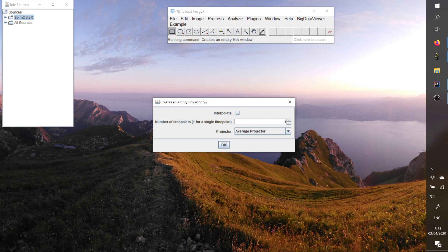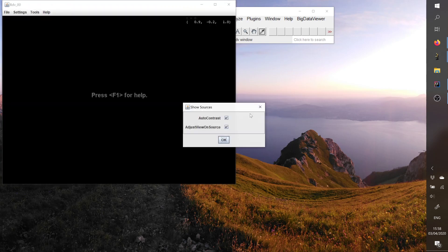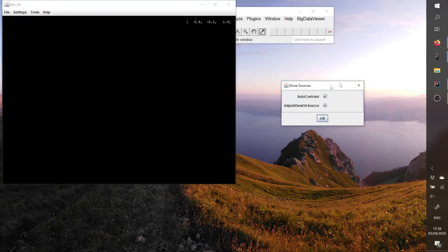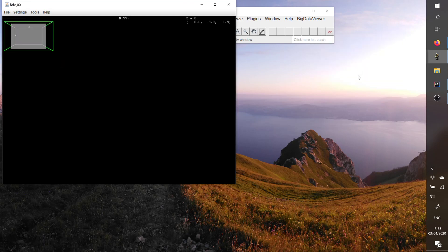Here we have only a single time point and I will not interpolate by default. After, it's asking if you want to center the view on the source or do an auto-contrast. So we can just let this on.